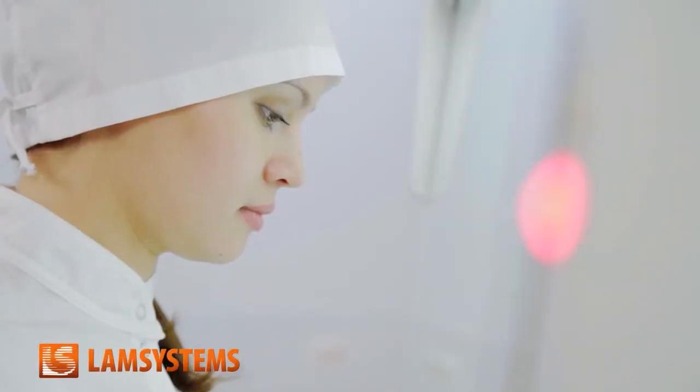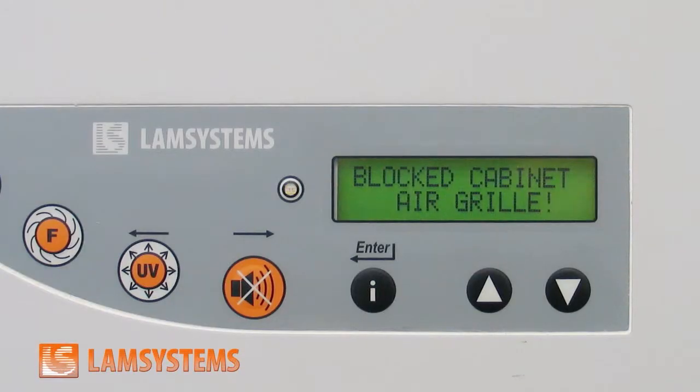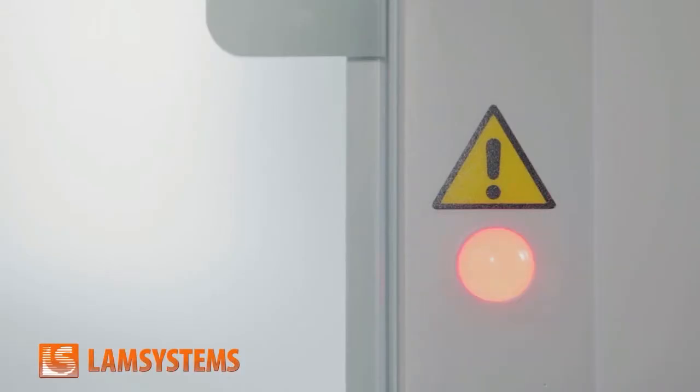The cabinet has an audio-visual alarm system with an immediate response to the accidental coverage of the front air grill, and it will warn the operator of danger in due time.